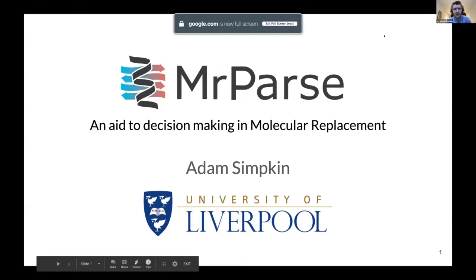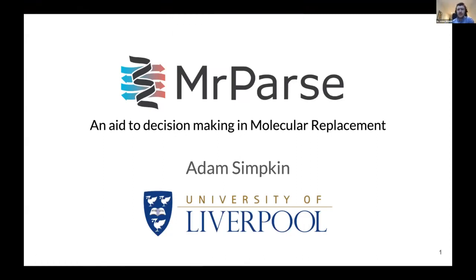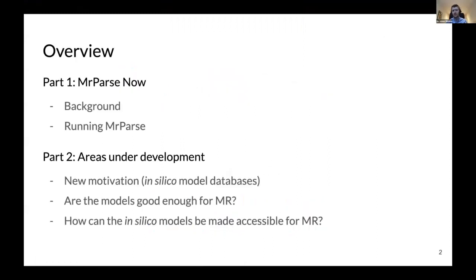So yes, I'll be talking about MrParse today. What we've developed MrParse to do is to try and aid in molecular replacement decision making. To give you a quick overview of the talk, I'm going to split this into two parts. The first will be on MrParse now, a little bit of background about why we decided to develop it and how you might run it. The second part, which I think is perhaps more interesting, will be the areas that we're currently developing.